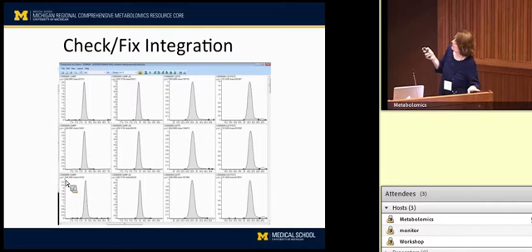But what I want to point out here is, and I don't know if you can really tell anything from the labels up there, one of the things that we do along with your samples is we'll take an aliquot of all of the samples that you've sent us that we've prepared for you by extracting them with the extraction buffer. Say if you send us 20 samples, we'll take 10 microliters out of each one and put it into what we call a pooled sample. So basically, we're trying to look at the average characteristics of all of your samples that you've sent us.